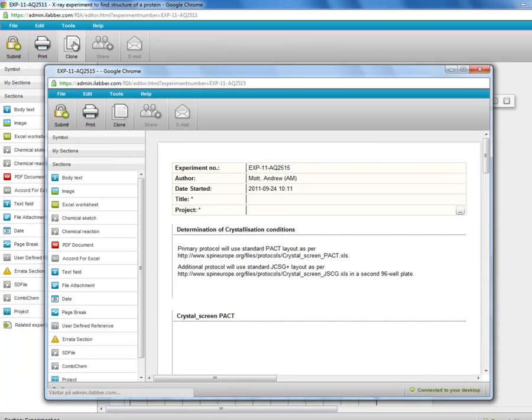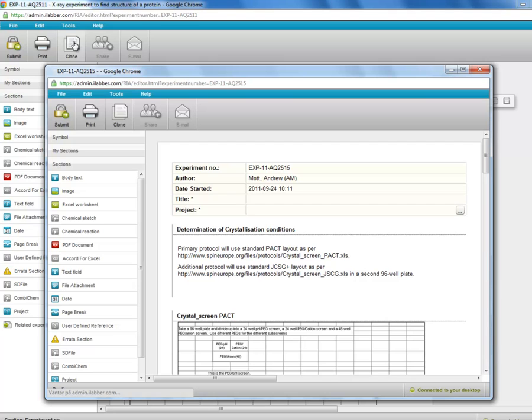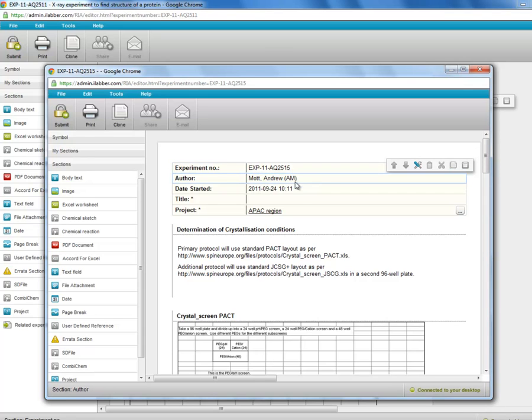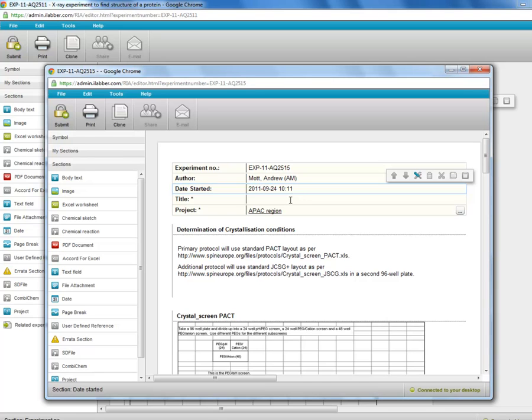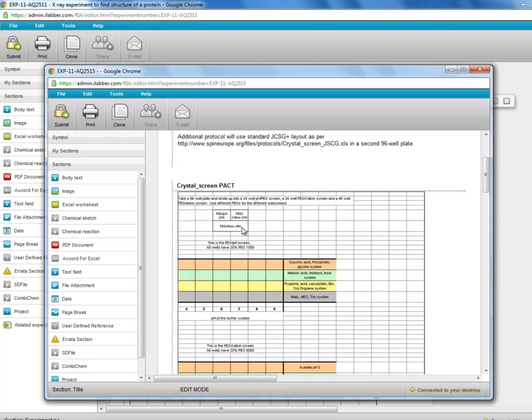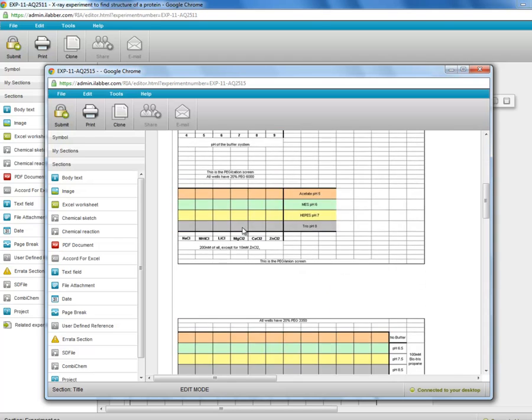So here we see the new experiment. It has a new experiment number. It has you as the author even if you've cloned a colleague's experiment. And it has the new time when you have created the new experiment. There is no title, a new title has to be entered. All the other sections are identical to the previous experiment.